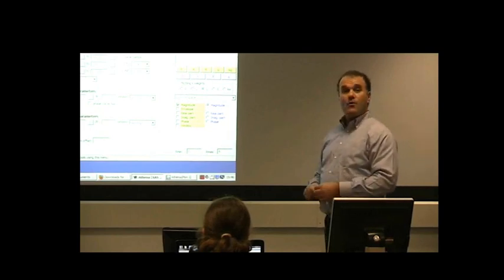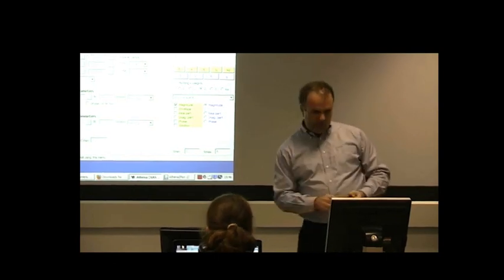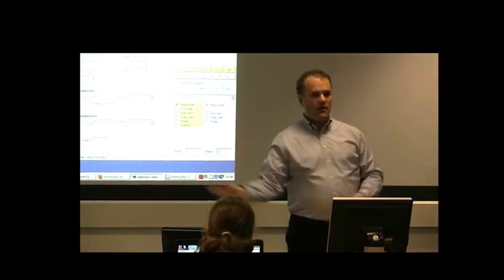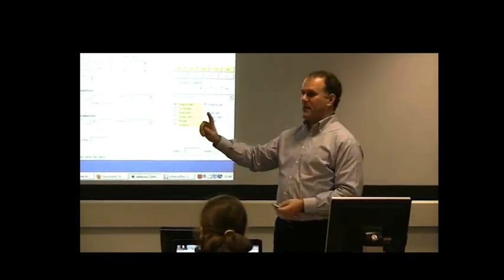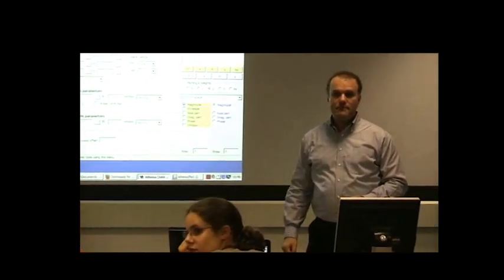Oh, E0. Yes, E0. Okay. Before I explain how E0 gets chosen by the software, are there any lingering questions about background removal? Yes? Where does the background come from? I mean, what are you actually doing?